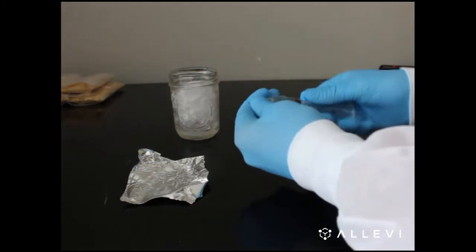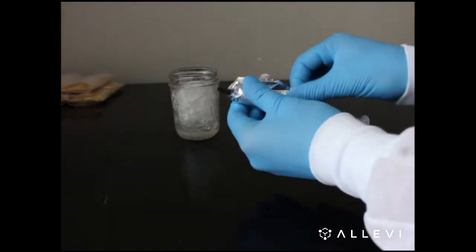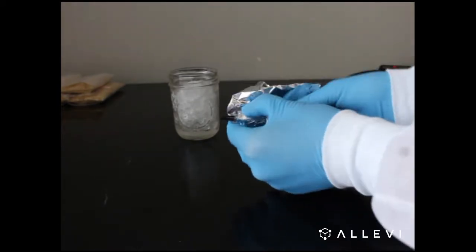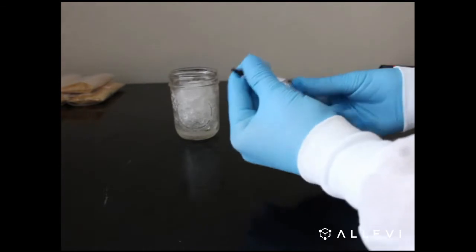Next, cover the syringe in tin foil. In order to get the ideal printing consistency, put the syringe on ice for about 10 minutes.